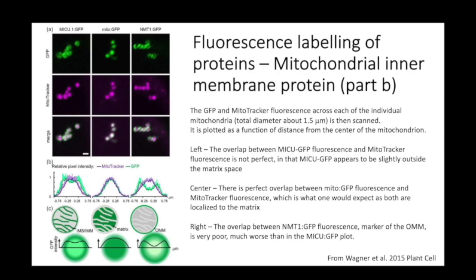In the center, there's perfect overlap between mito-GFP fluorescence and mitotracker fluorescence, which is what you would expect because the mito-GFP fluorescence was directed to the matrix.